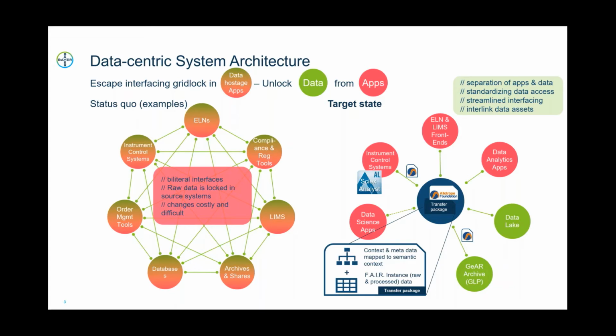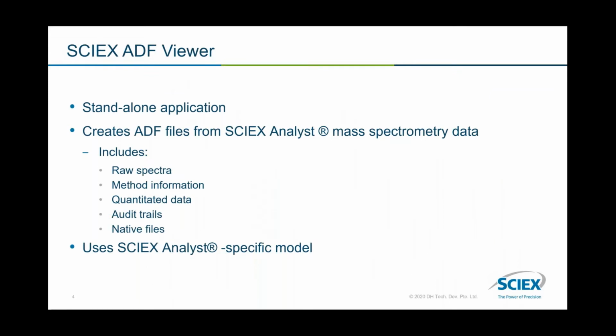Thanks, Henning. So this phase of our project was to create a viewer for the ADF files that have been created by our Analyst interface. Of course, it's very difficult to review data without a full-featured viewer. This viewer is a standalone application, meaning that it can be run independent of the Analyst software, which is in contrast with the implementation of the converter, where in order to convert or at least extract the data from the Analyst environment, it requires that the Analyst software be installed on the machine.